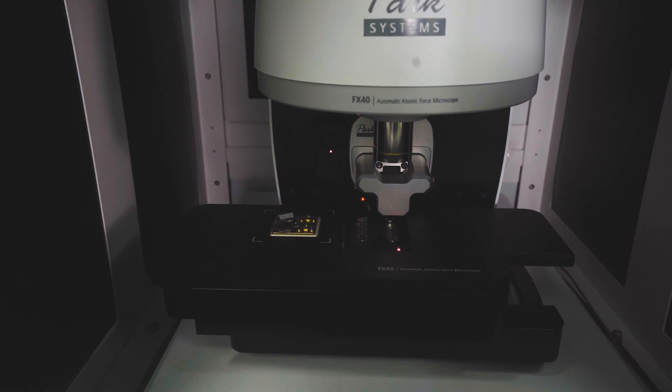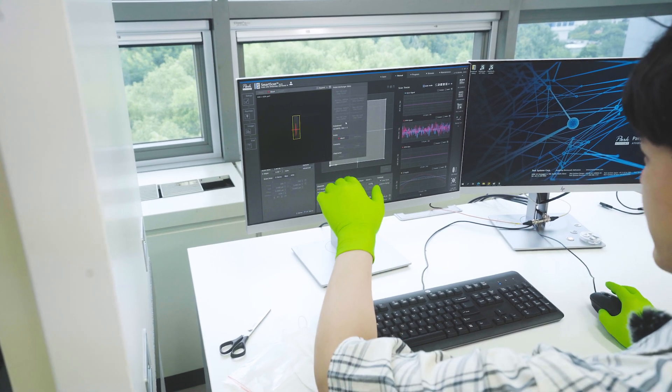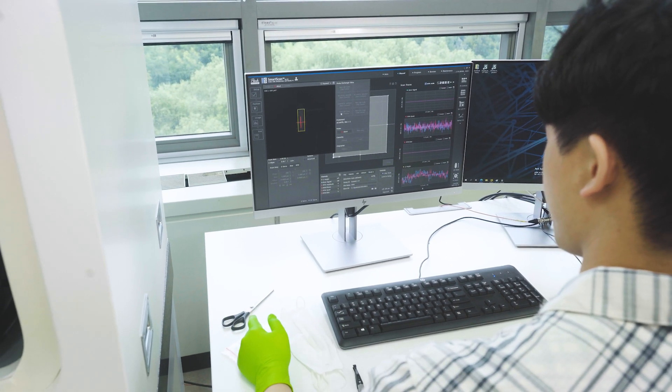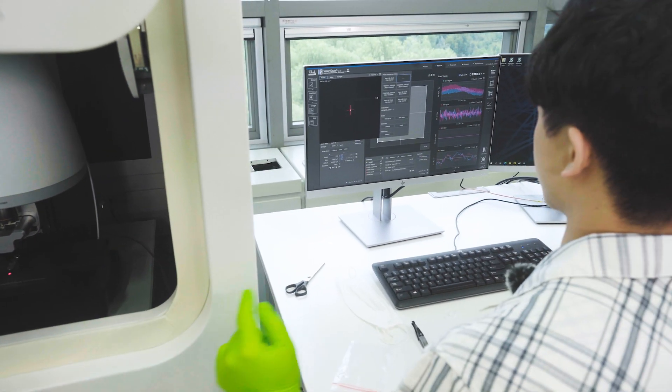Very gentle. And if you see on the screen here, the camera is now auto-focusing on the cantilever at the end of the chip. There we have it — the chip is ready to scan.